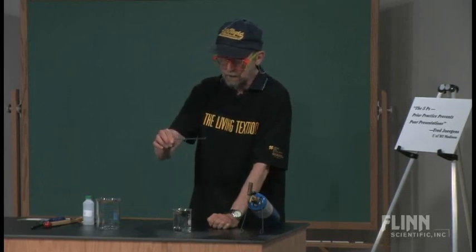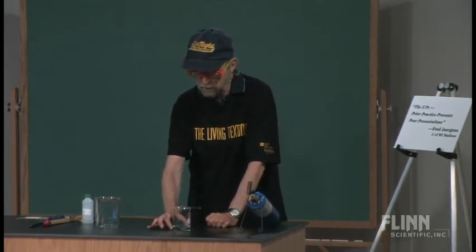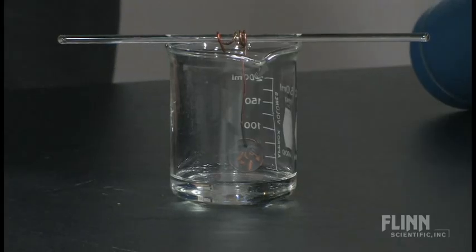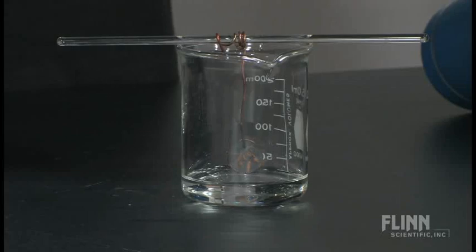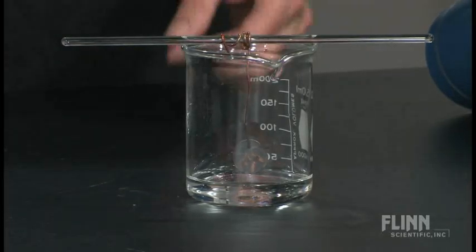To optimize this, you want to put it over the surface of some acetone. You don't need a lot — you can use a smaller amount than this. The penny should be hanging right over the surface. I have a 250-milliliter beaker here, but you could use a 50-milliliter beaker with a very small amount of acetone.